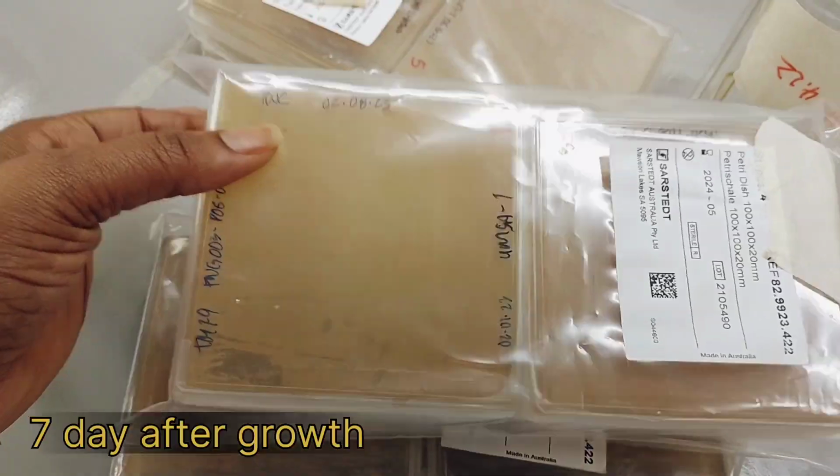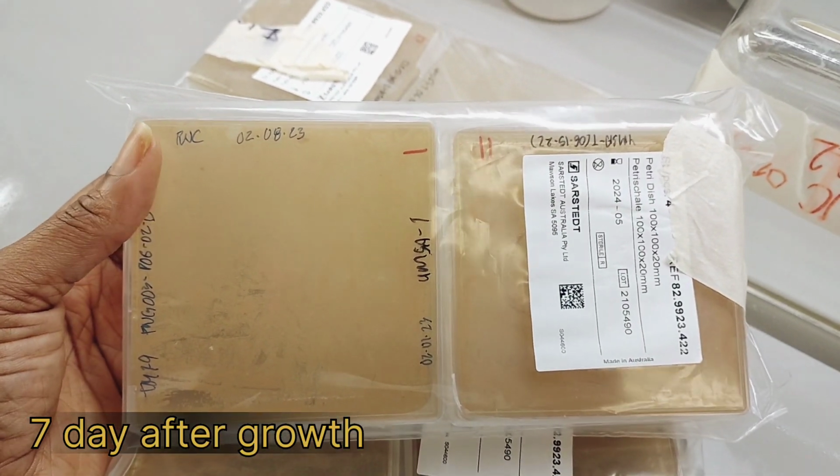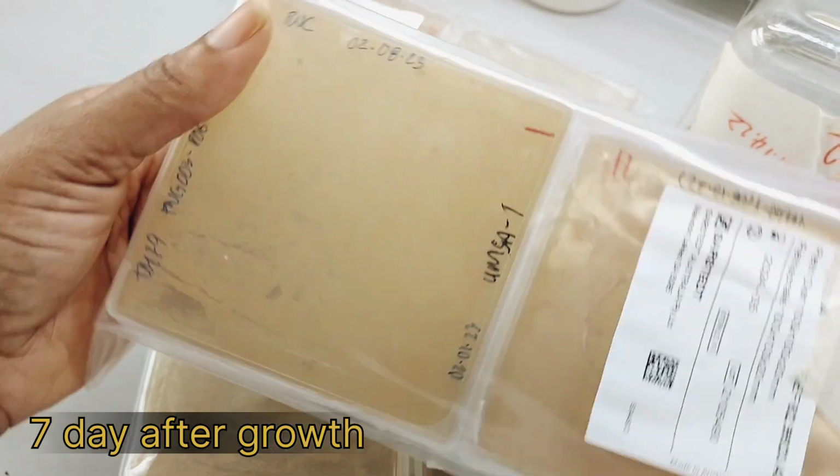So I'm going to show you what they look like, because remember in the inoculum initiation video I was just applying the fungus from those small vials that looked like it was just water onto the plate, and there was nothing on the plate when I was done. So at 7 days, I'll show you what they look like. They looked like they didn't have anything on them at the time of inoculation. Now they have things growing on them.